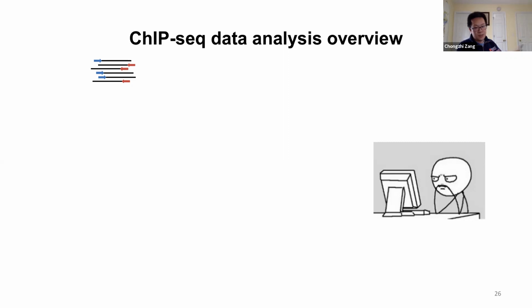So the genome tiling array is actually the real ChIP microarray that can cover the entire genome. Whereas the first one only covers the promoter region, which is just a very limited part of the entire genome. Thanks, Stefan.